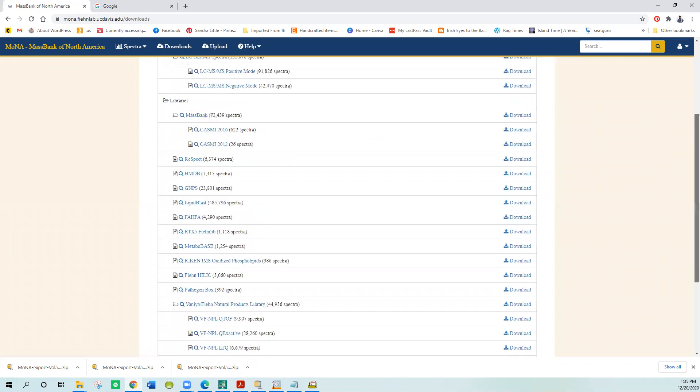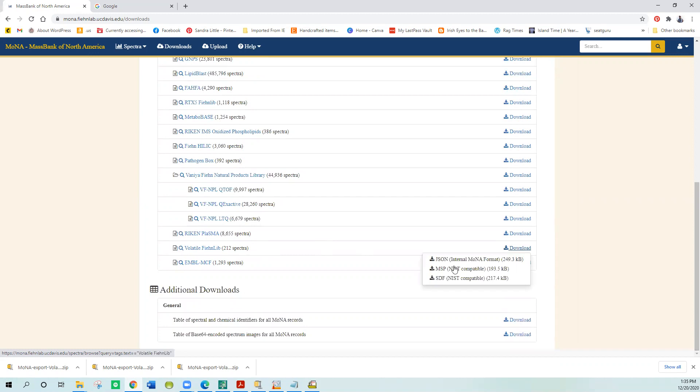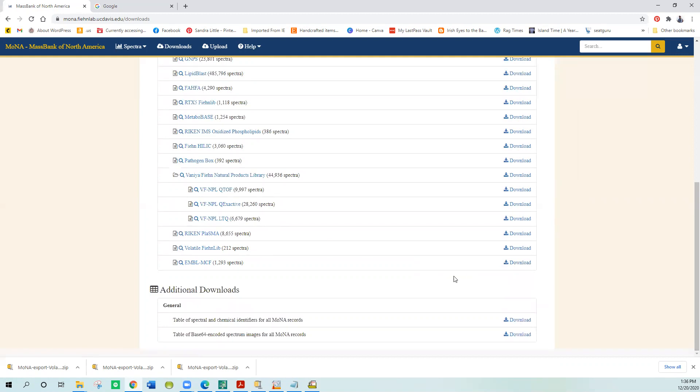I'll show you how to do a small one today because it takes too long to watch while we're sitting here. So I'll first have to download that library. I'm going to download this FIN library 212 Spectra. The MSP format only contains the Spectra. The SDF contains the Spectra and the structures in a format that NIST can convert.